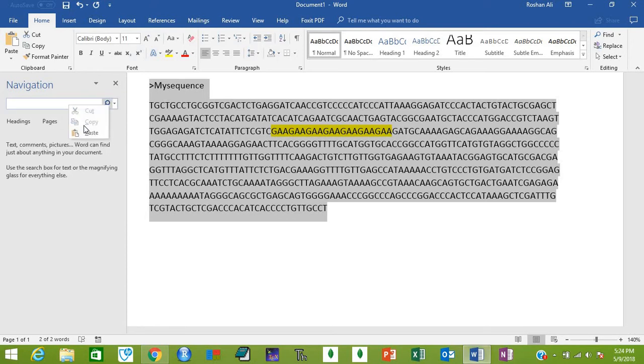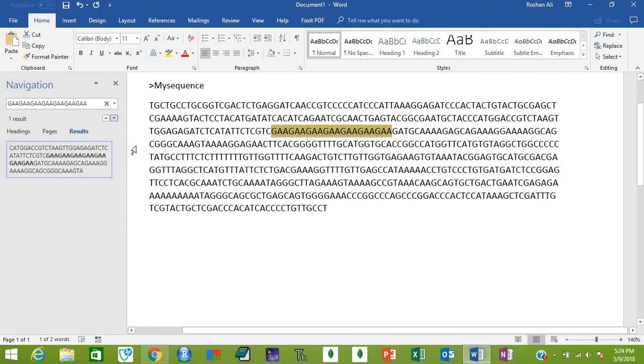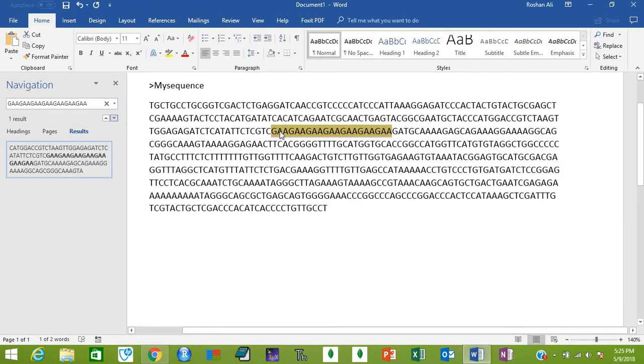As soon as you press Enter, it will show you the highlighted region. This is the SSR that Batch Primer 3 has found for you, so it is correct.